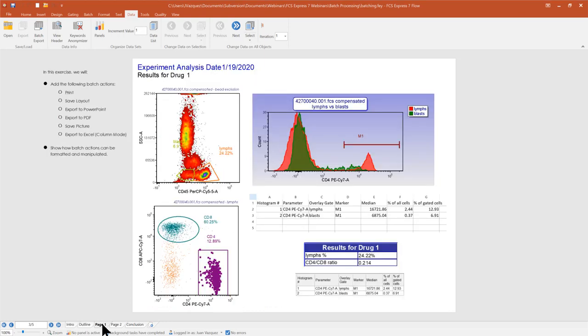I have a basic template set up to demonstrate different things we'll do today. This webinar won't cover the basics of inserting plots, gates, and stats — please feel free to watch our other webinars for those topics. Today's webinar will focus specifically on analyzing data and batch processing it, covering everything we can do with batch processing in FCS Express.